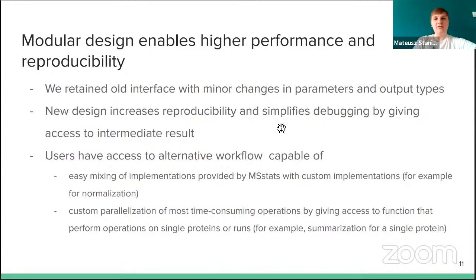So for all the users or people who just need those functions we already had, we retained the old interface with very minor changes. So all that you learned yesterday, or you will learn about MSstats today, will be still valid with very minor changes, like some type of the output might change, or some parameters will be gone.